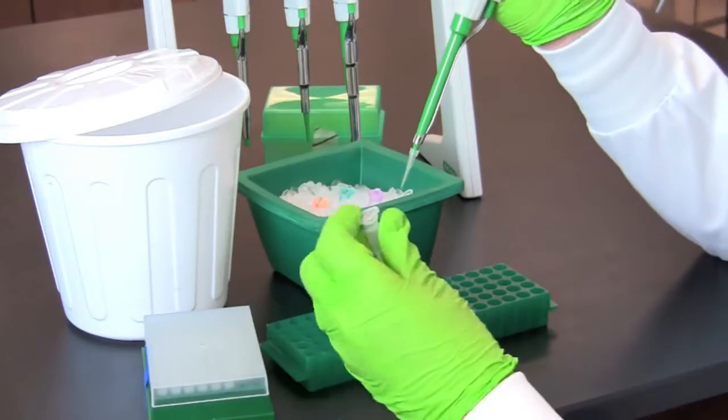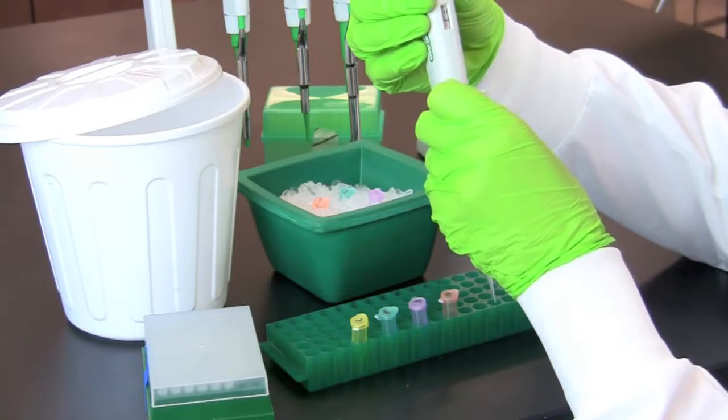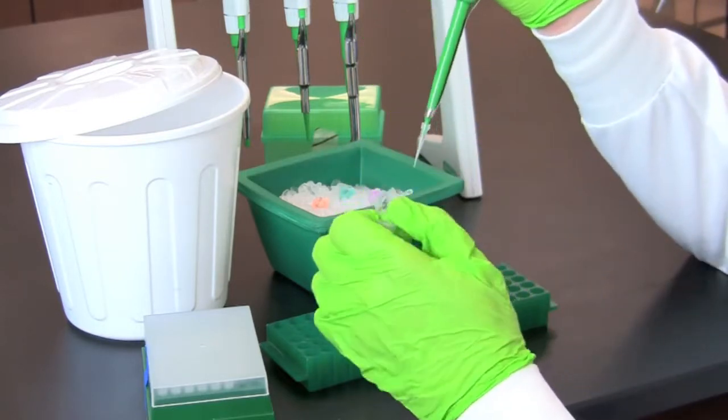Again, using a fresh tip, reset your micropipette to transfer five microliters of 2X restriction buffer to the color-coded tube labeled E.